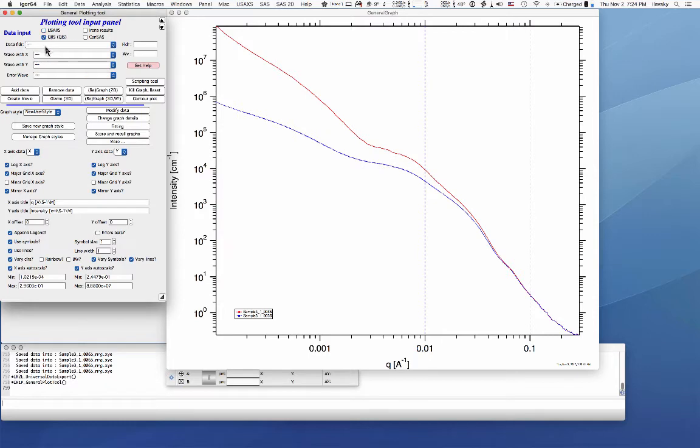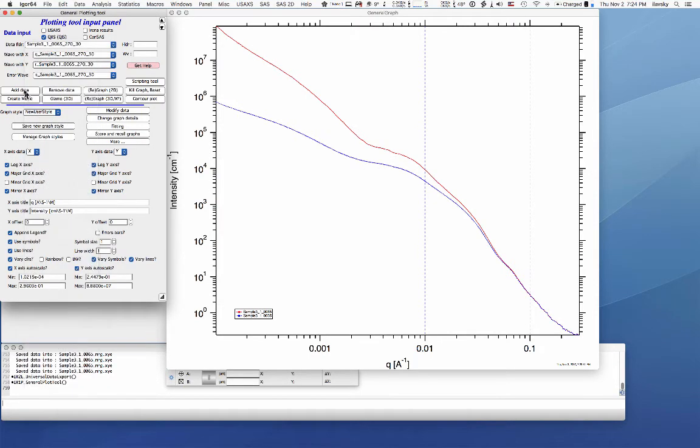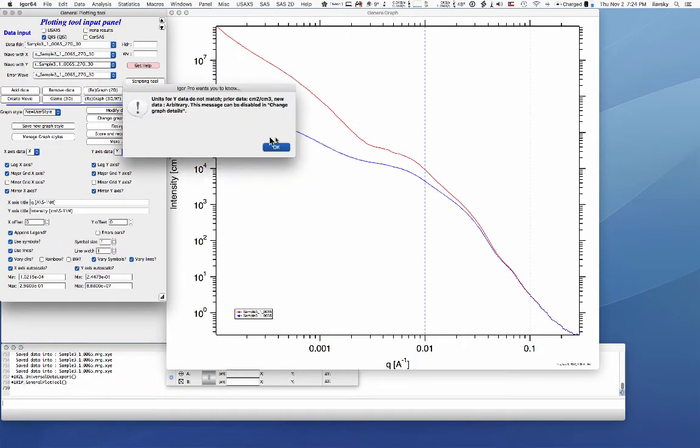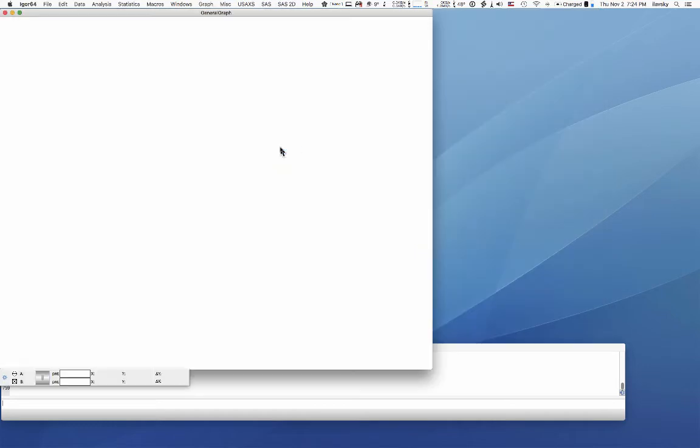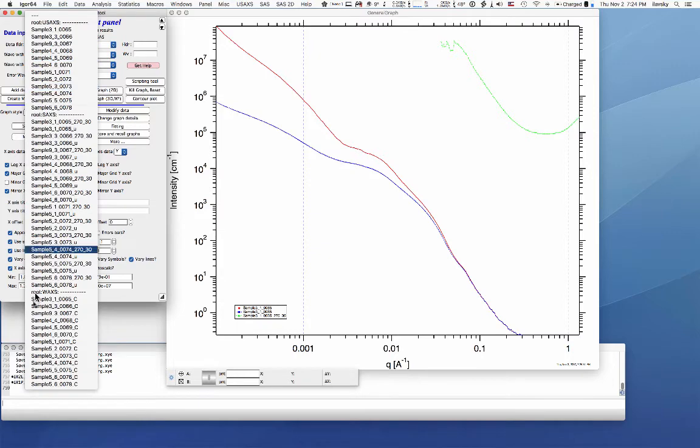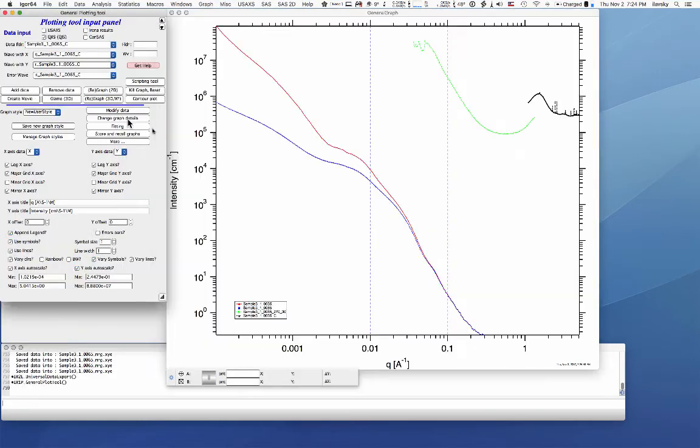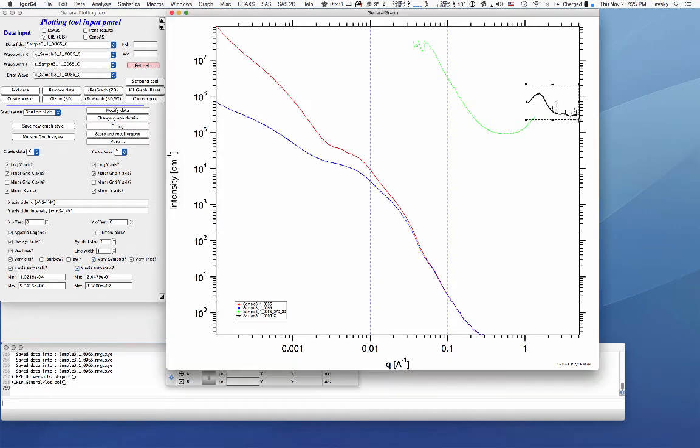If you now look inside here. Here is for example the SAXS data set. So that's where our SAXS data are. And then if you look on WAXS, you have a WAXS here. And so this is a powder diffraction data. We have a hump here. We get some diffraction peaks here. People may want to analyze this and they need to analyze this in a specialized powder diffraction packages like GSAS-2 or so.